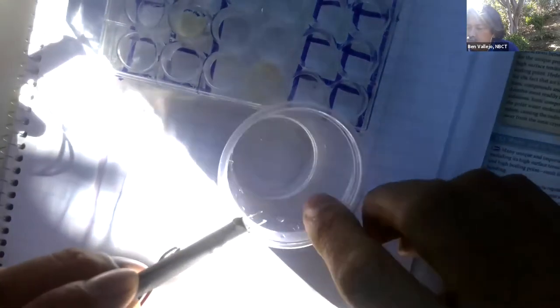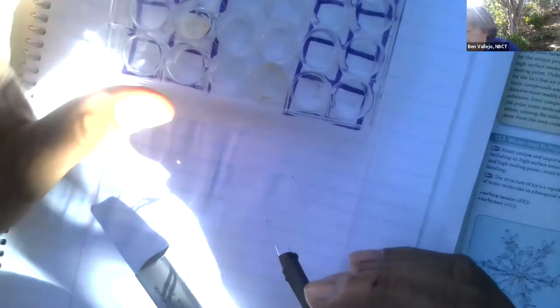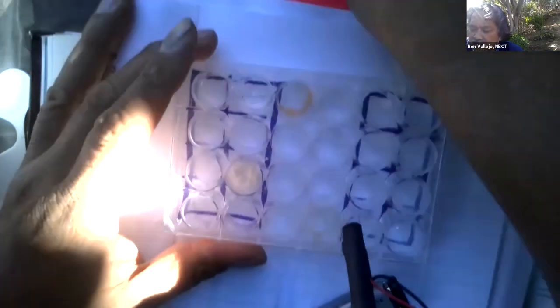Okay. Third one is what? Okay. Third one is sugar. Now, from what we just did in 2.1, do we expect the sugar to light up? Do we expect it to dissolve or dissociate in water? Is it ionic or is it a polar covalent molecule? Considering those things, I'm going to put this in here and I know what to expect. Well, let's see what we get.